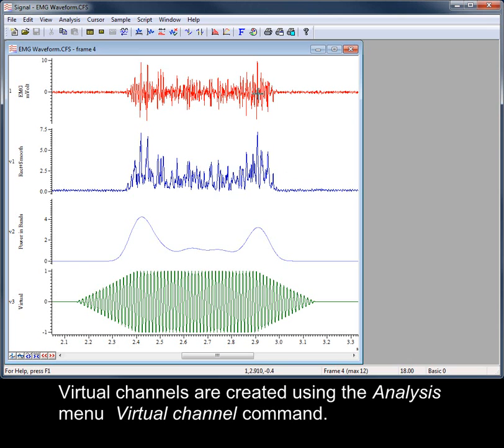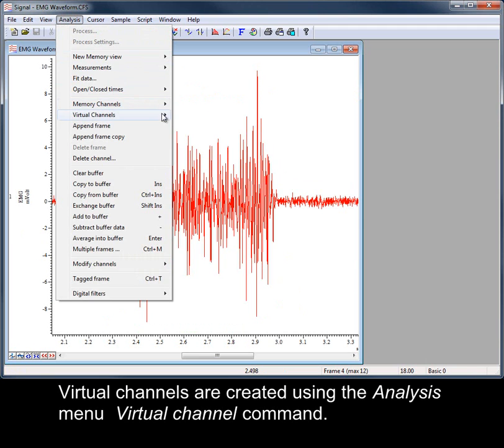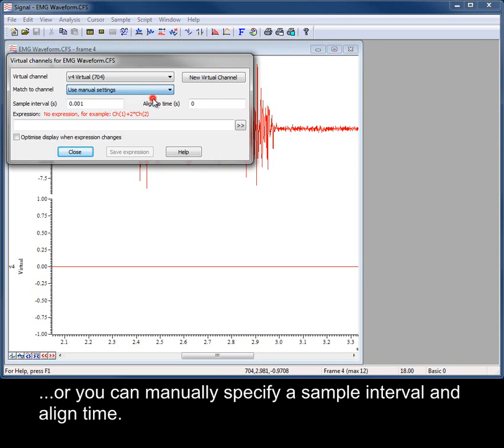Virtual channels are created using the Analysis menu Virtual Channel command. The new virtual channel requires a sampling rate. This can be matched to an existing waveform channel using the drop-down list, or you can manually specify a sample interval and align time.